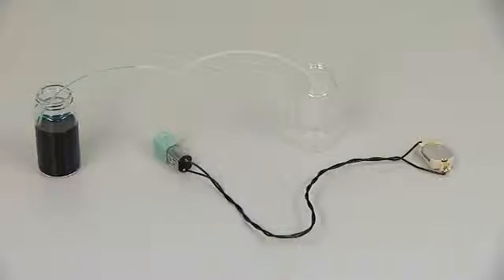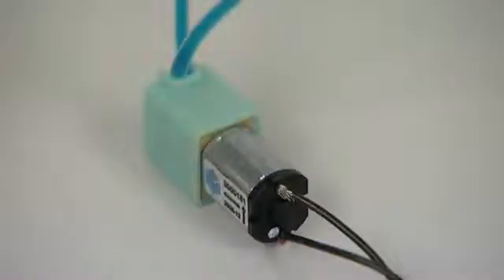Finally, our miniature peristaltic pump offers a low cost compact solution which can work for many hours from a single battery.